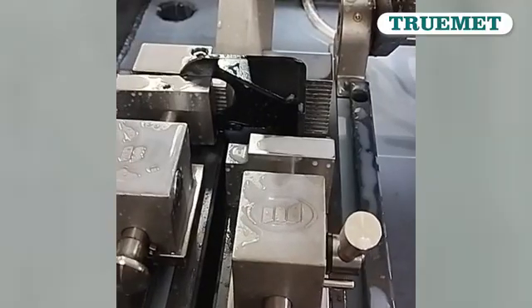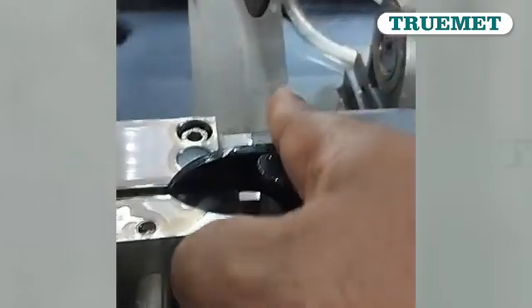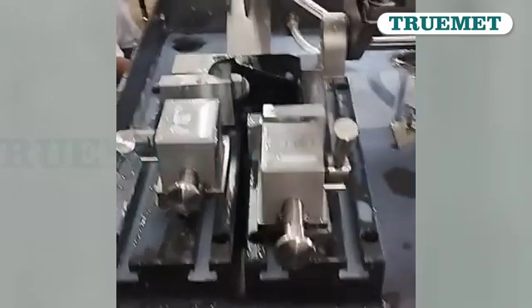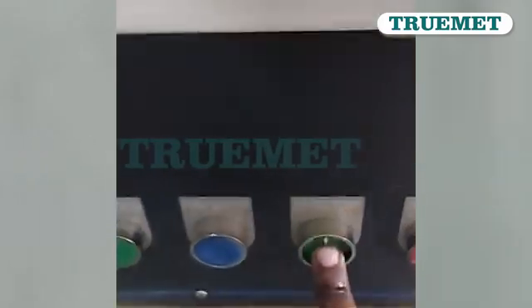So this is our first process, cutting of the sample. You can see the sample has been clamped and we are going to cut the sample like this. After that, we will remove the weld portion of this area. So it is clamped in our machine. Now going to start the cutting.